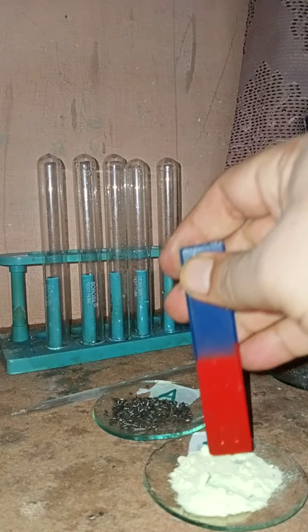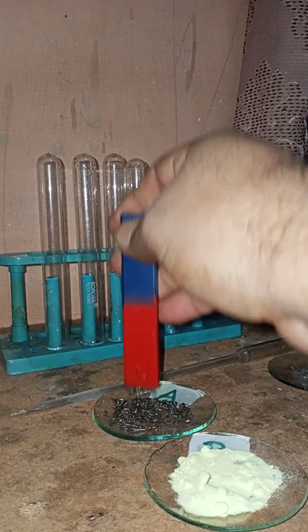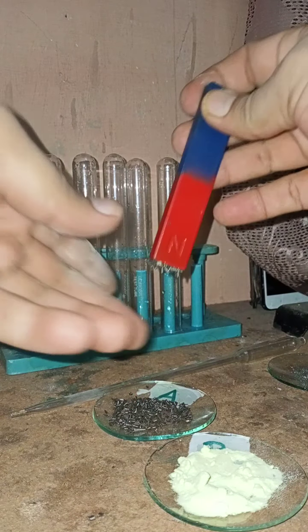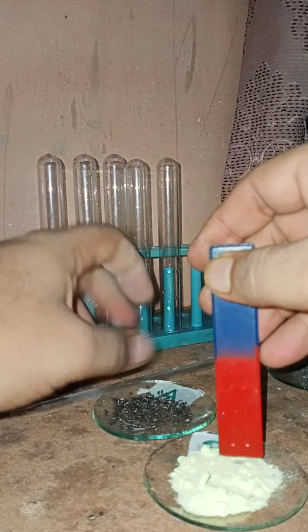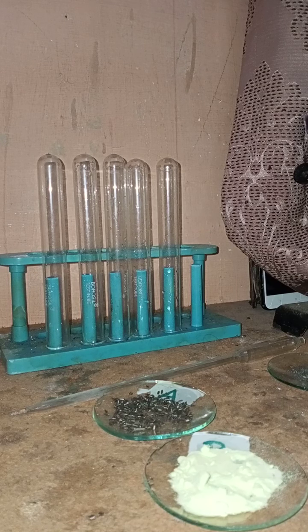So this is how the sulfur powder is not being attracted. There is attraction between the iron fillings and the magnet, but there is no attraction between the sulfur powder and our magnet. Now we are going to study the reaction of sulfur powder with carbon disulfide.